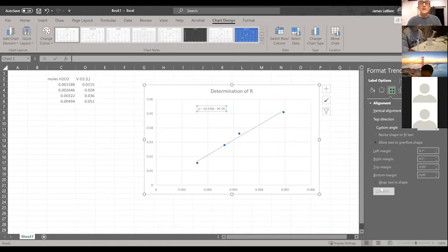Man, so it comes really close to 0. So my slope is 10.558. And so you remember what the slope was when, I'll take this back and put it on the whiteboard. Man, that is a really good result.